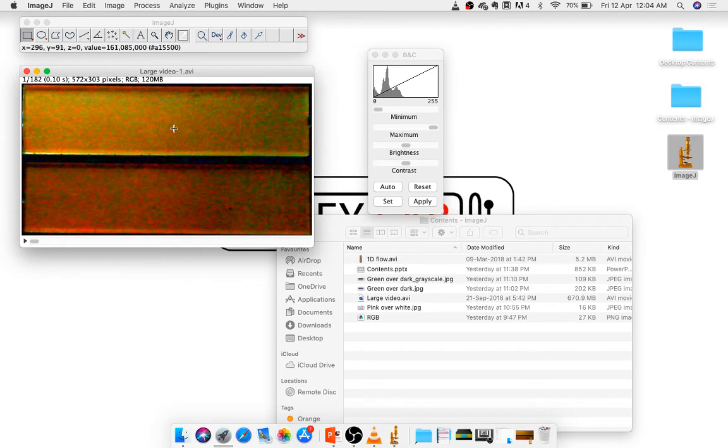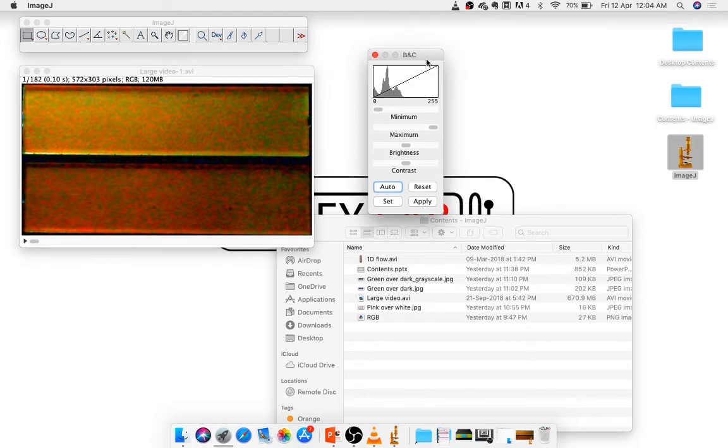And you can even see that most of the intensities here, if you look up the bar here, 150, maybe the brightest point is over here, 189, maybe a few pixels. But what ImageJ does is it says that 0 is black and 255 is the brightest it can be. You can make this brighter by moving this slider here. So basically this line will shift here. What I'm telling ImageJ to do is that I want you to think of this number, let's say 125 or 150, as the brightest possible point and 0 as the darkest possible point. So I'm going to move this slider now, and you can see here that the image gets brighter and brighter.